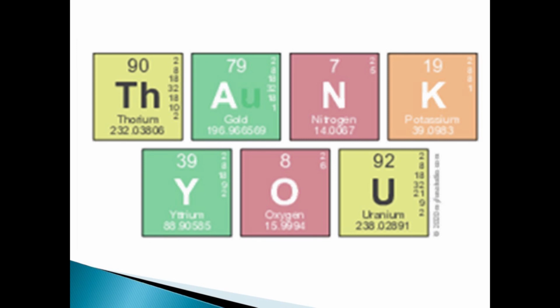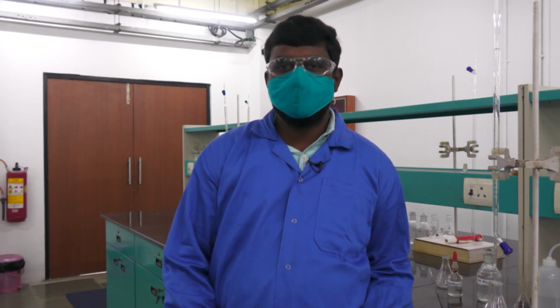Thank you. So finally we have done the standardization of H2SO4 solution and also the estimation of the amount of sodium hydroxide present in the given solution. So thank you.